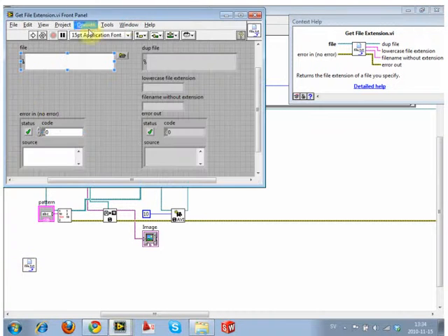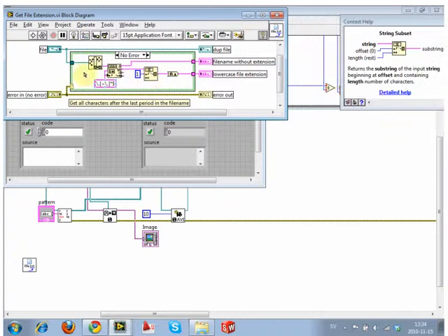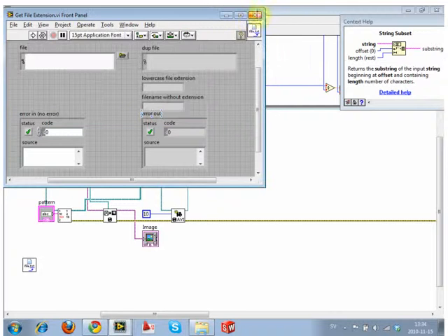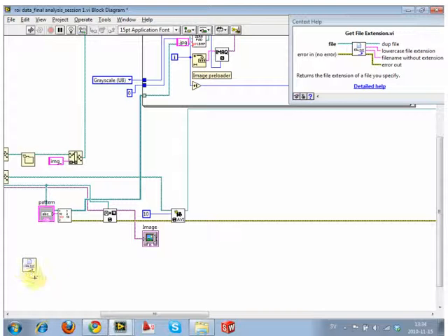So what we can do is take this file name and invert it so that it runs txt.elif in this example. And then we say, look, go 4 to one side. So it goes 1, 2, 3, 4. And then you say, did you hit a decimal point? Did you hit a letter? If you hit a decimal point, then the 3 characters before it are the file extension. If you hit a letter, then move back 1, and then the 2 characters before it are your file extension, because it can't be less. You only have 2 choices, 2 or 3. So we can rebuild this very easily, and I do sometimes.